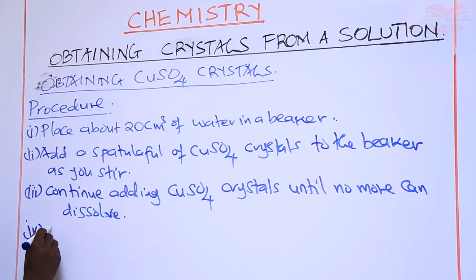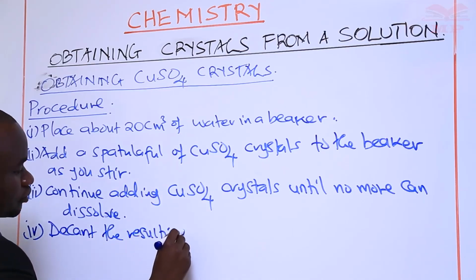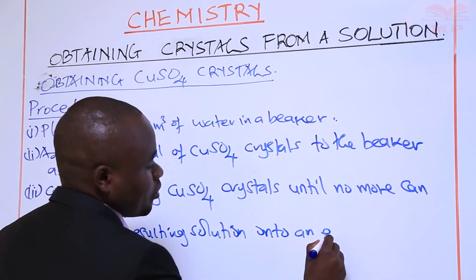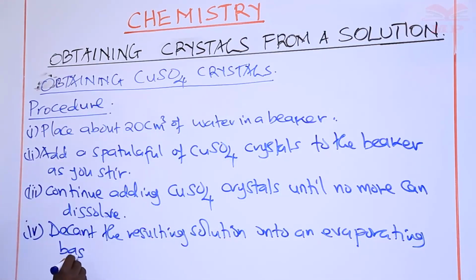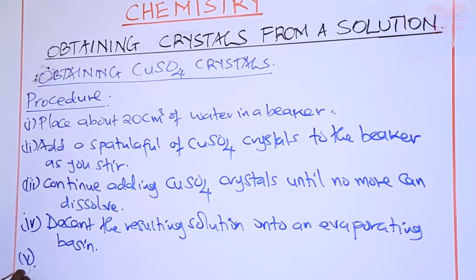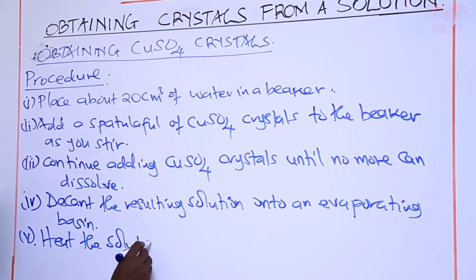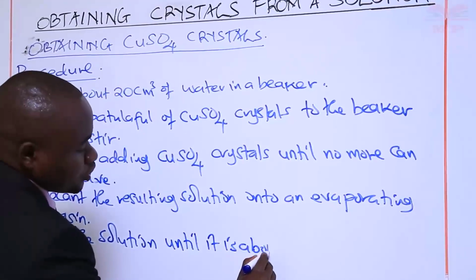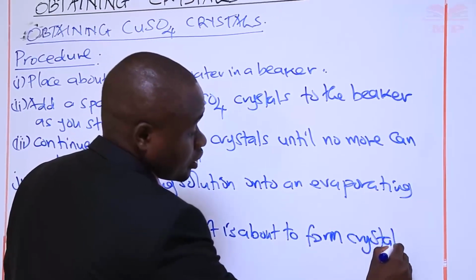Then after that, you decant the resulting solution onto an evaporating basin or evaporating dish, and then from there you heat the solution until it is about to form crystals. So how will you know?